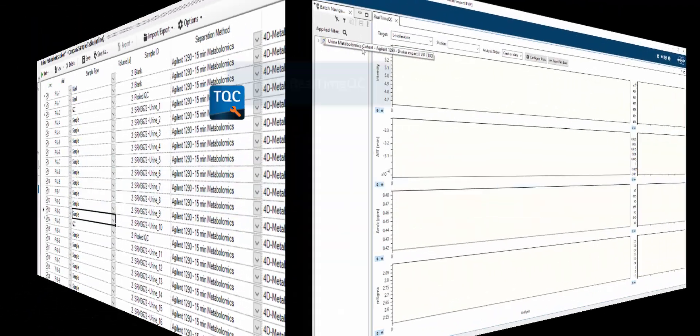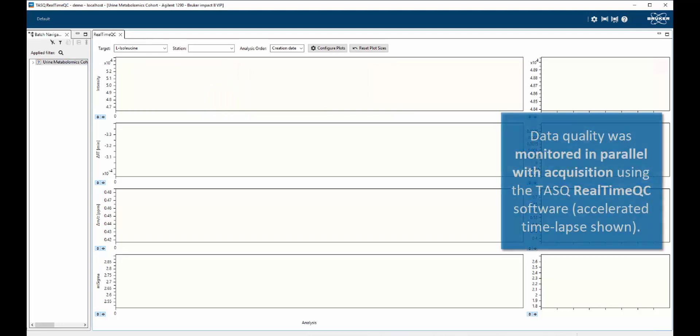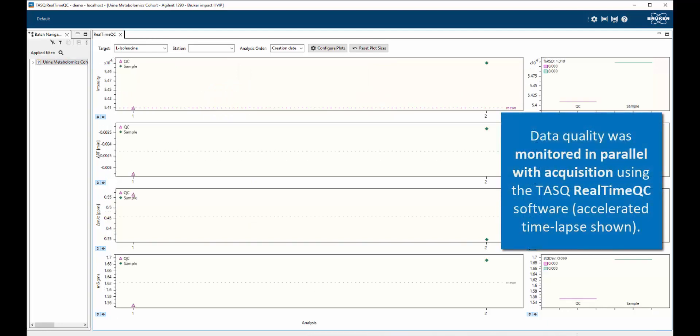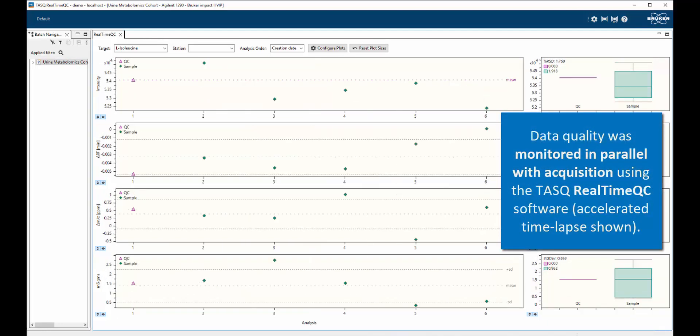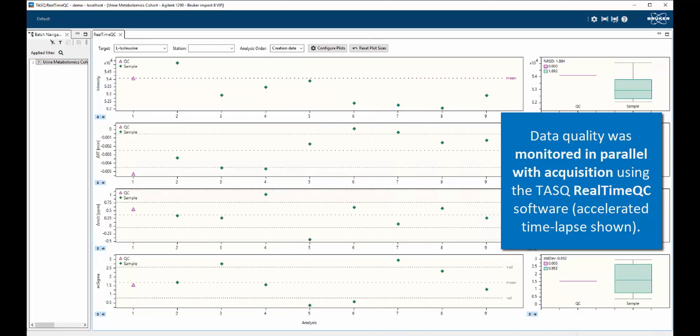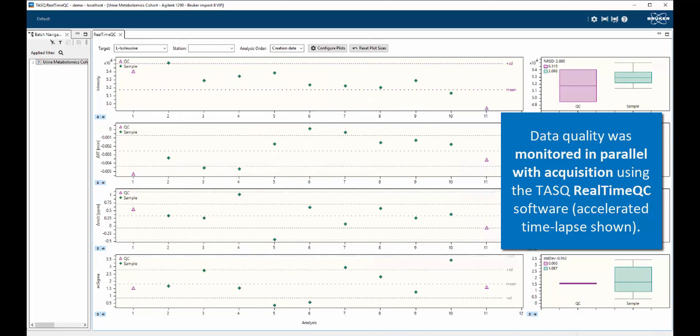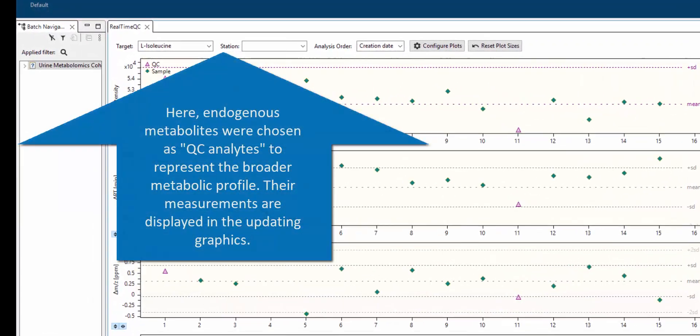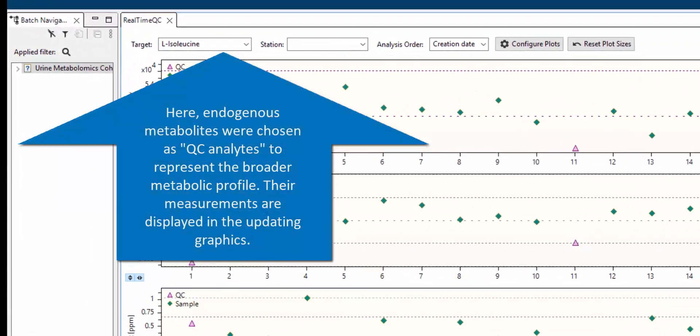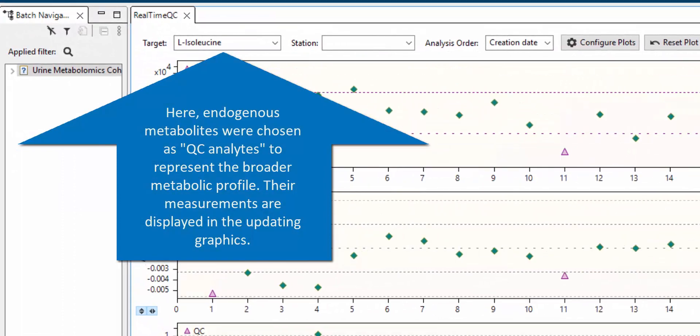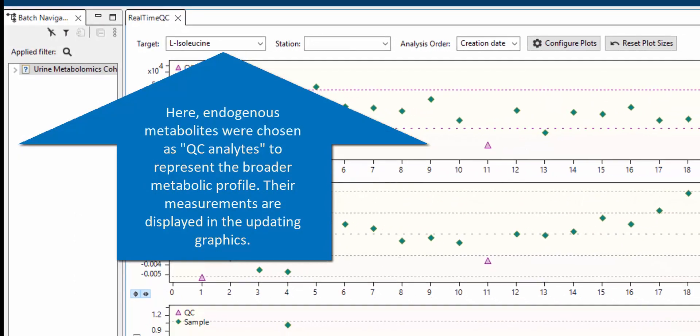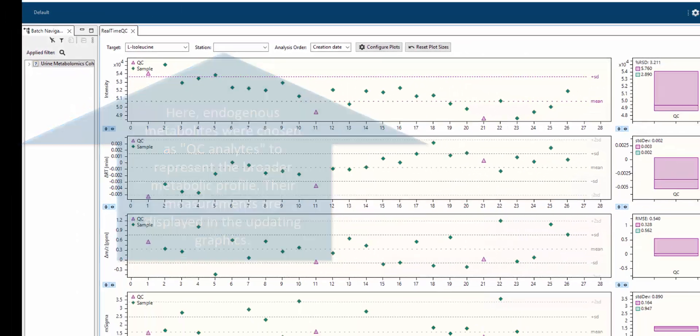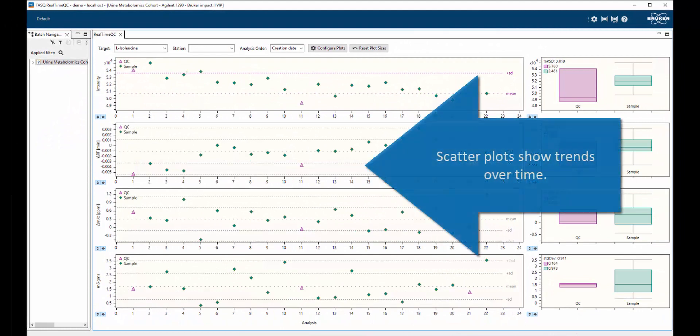After sample analysis is initiated, Real-Time QC will employ a user-defined task method for the targeted analysis of QC analytes selected to represent the quality of the complete dataset. The analyst may define and monitor as many QC analytes as they like, including endogenous analytes and internal standards.